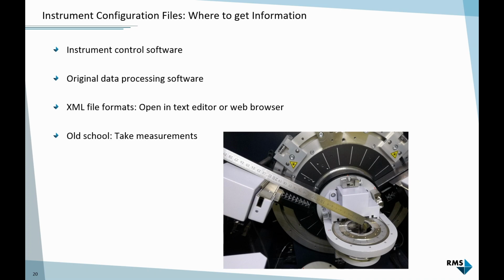So my first attempt to find the hardware information is always the instrument control software. I think for Panalytical it was called the data collector back in the days when I used Panalytical. Bruker, it's called Diffrac Measurement Center, and Rigaku I don't remember, I've never used it myself.